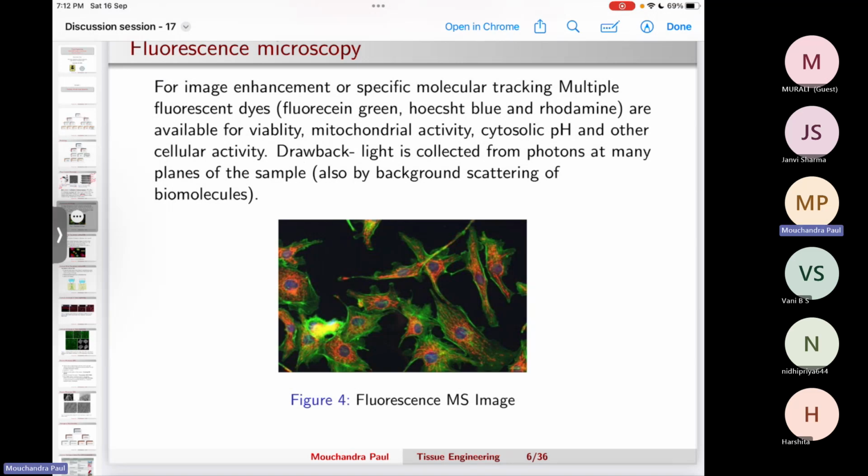So in order to distinguish each type of structure, like you want to see how the nucleus looks like, or the cytoplasm, or the cytoskeletal elements, what we do is tag these structures with fluorescent dyes. These dyes have the unique property to bind to specific types of proteins that are only available on these types of cellular organelles.